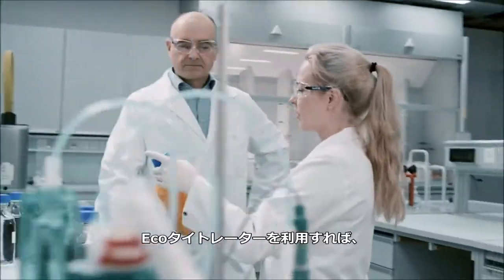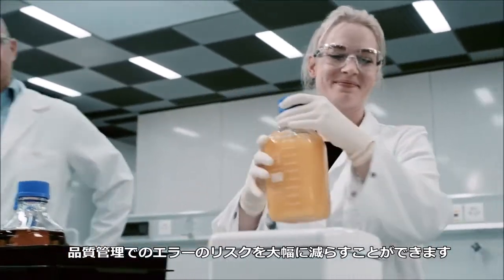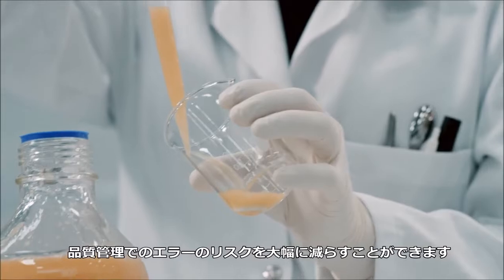With the EcoTitrator, you can drastically reduce the risk of errors in your quality control.